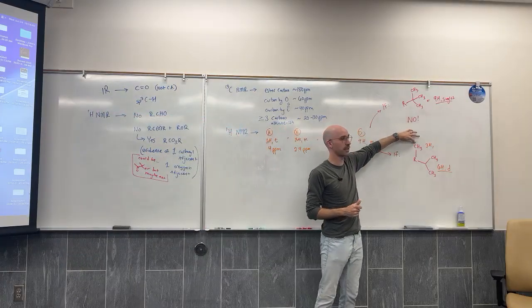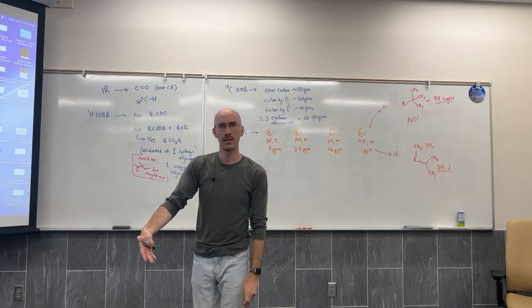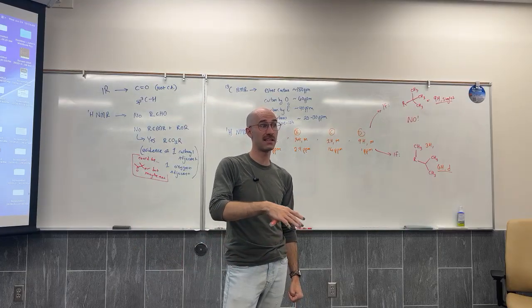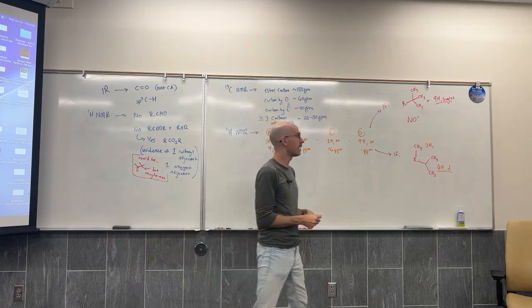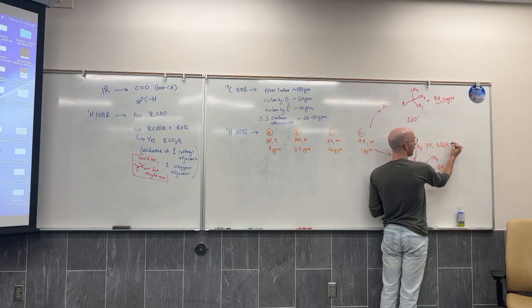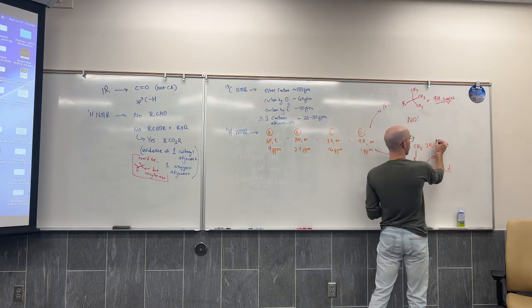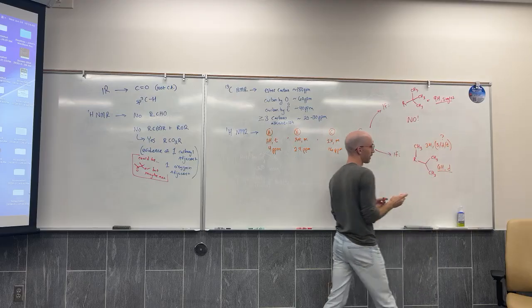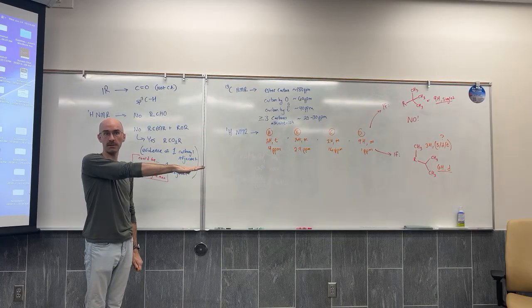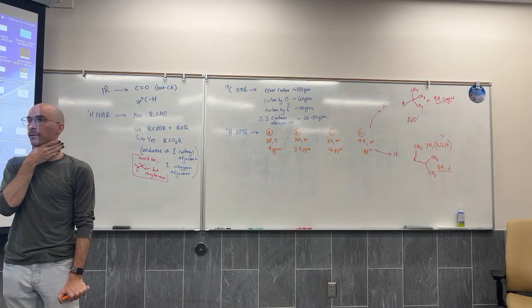This CH3, well, it depends. Is it bonded next to a 1H? Or is it bonded next to a CH2? Or is it not bonded next to anything? This could be a singlet, it could be a doublet, it could be a triplet. Right now, we don't really know. So I'm going to leave this in parentheses with a big question mark over it. And I'm not necessarily confirming the 2 CH3s on the right either, but we're just brainstorming right now.